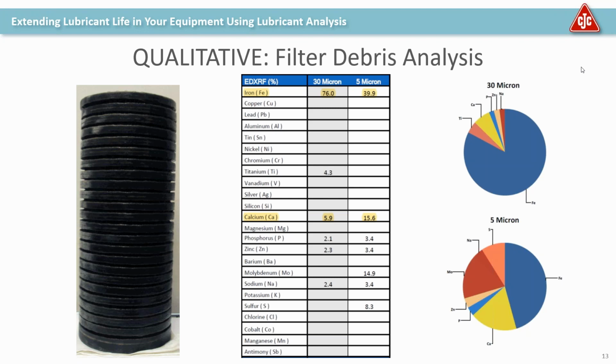That would be something I highly recommend you work with your vendors on to develop, number 1, a good procedure for doing this. Number 2, it might not hurt to do a mix of whatever the ratio is that you're planning, run some testing on that to make sure that the performance characteristics and the chemical composition characteristics of the lubricant are where you are wanting them to be at with that ratio. But I think it can be a good idea overall. There are a few cases, very few cases where I would not recommend it, as long as you're very careful.